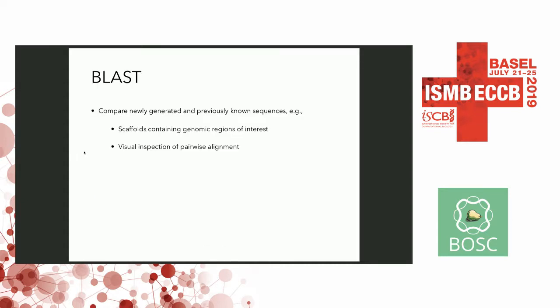BLAST is a really popular tool to compare sequences, and with the drop in sequencing prices, that has created a lot of opportunities for novel research, which relies on comparing newly obtained and previously known sequences. The example use cases could be very simple, to locate a genomic region of interest in an assembly, or even to just look at the pairwise alignments visually to characterize gene functions and so on.